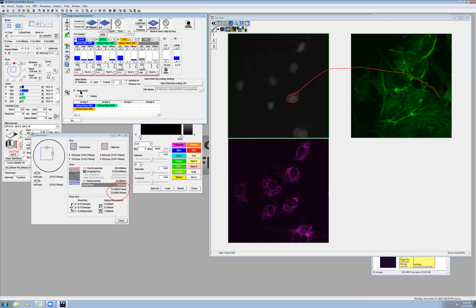Right. Because right now, if you think of it, it takes 32 seconds to image this much, right? And if you go to acquire a Z series, it's going to take forever. It gets very boring for you to sit over here and keep on staring at this. So the first thing, for any new sample, is to figure out the imaging conditions. Spend like 15, 20 minutes optimizing all of that. And once you optimize those imaging conditions, life is good.